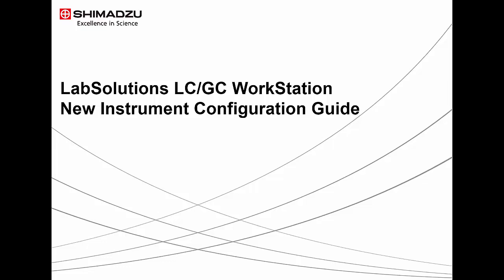In this video guide, we are going to go through performing an initial instrument communication setup and hardware configuration.